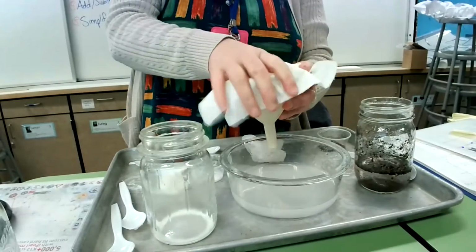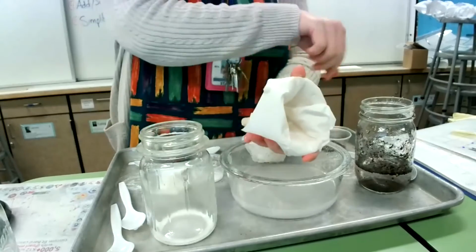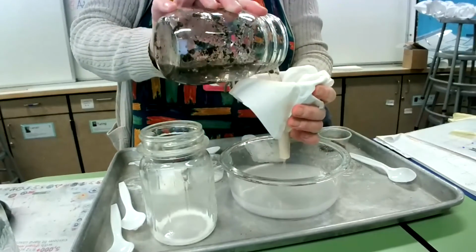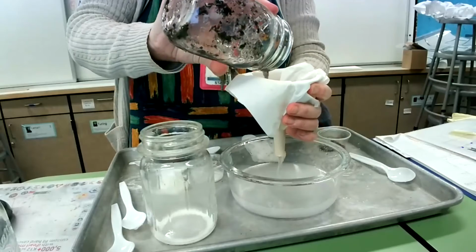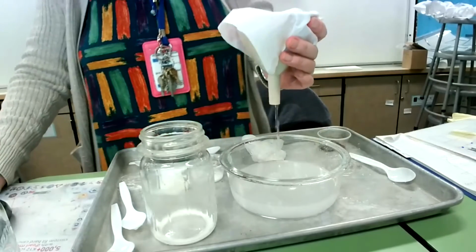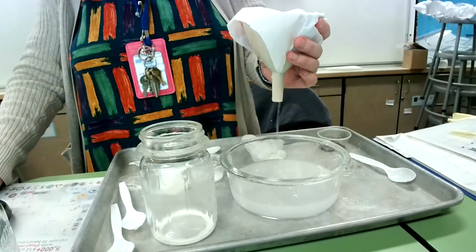So I'm going to do another filter here in my funnel. And this time I'm going to do the soil and sand. Notice what's coming through is clear. I don't see any sand or soil in there.